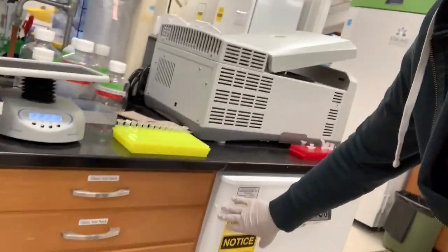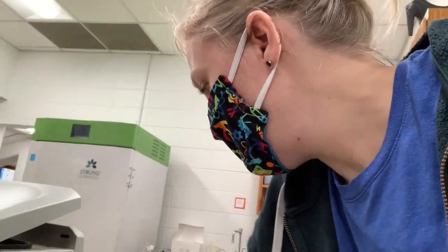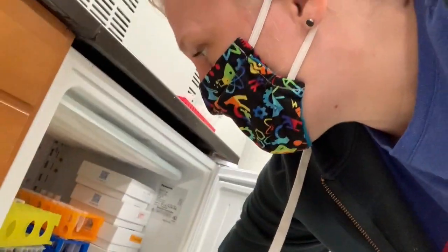So this, as you can see, will already start precipitating the material, but you can also facilitate this by putting your reactions in the freezer. We have several -20 freezers around in the lab. I have one right here by my bench, so I'm going to use it. And I just stick the whole rack in there.